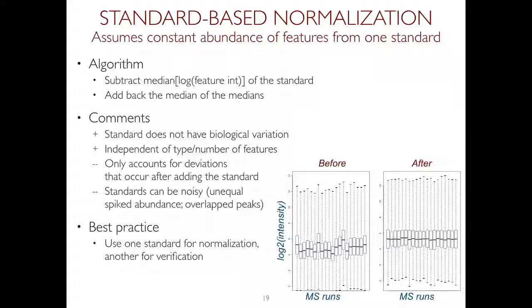Well, ideally, you would have some endogenous proteins which are very tightly regulated and don't change. I've never seen such a thing, but that would be ideal, right? But you can use endogenous ones. If you know in your biological setting that something doesn't change, those are the best because those account for everything which happened to the sample. It's hard to know those, but if your specific setting has those, by all means use those. Maybe if we're now talking in the DIA setting where we have a lot of information, do you think that the global median or quantile approach is going to be more stable than this type of spiking you're talking about, or have you looked into this?